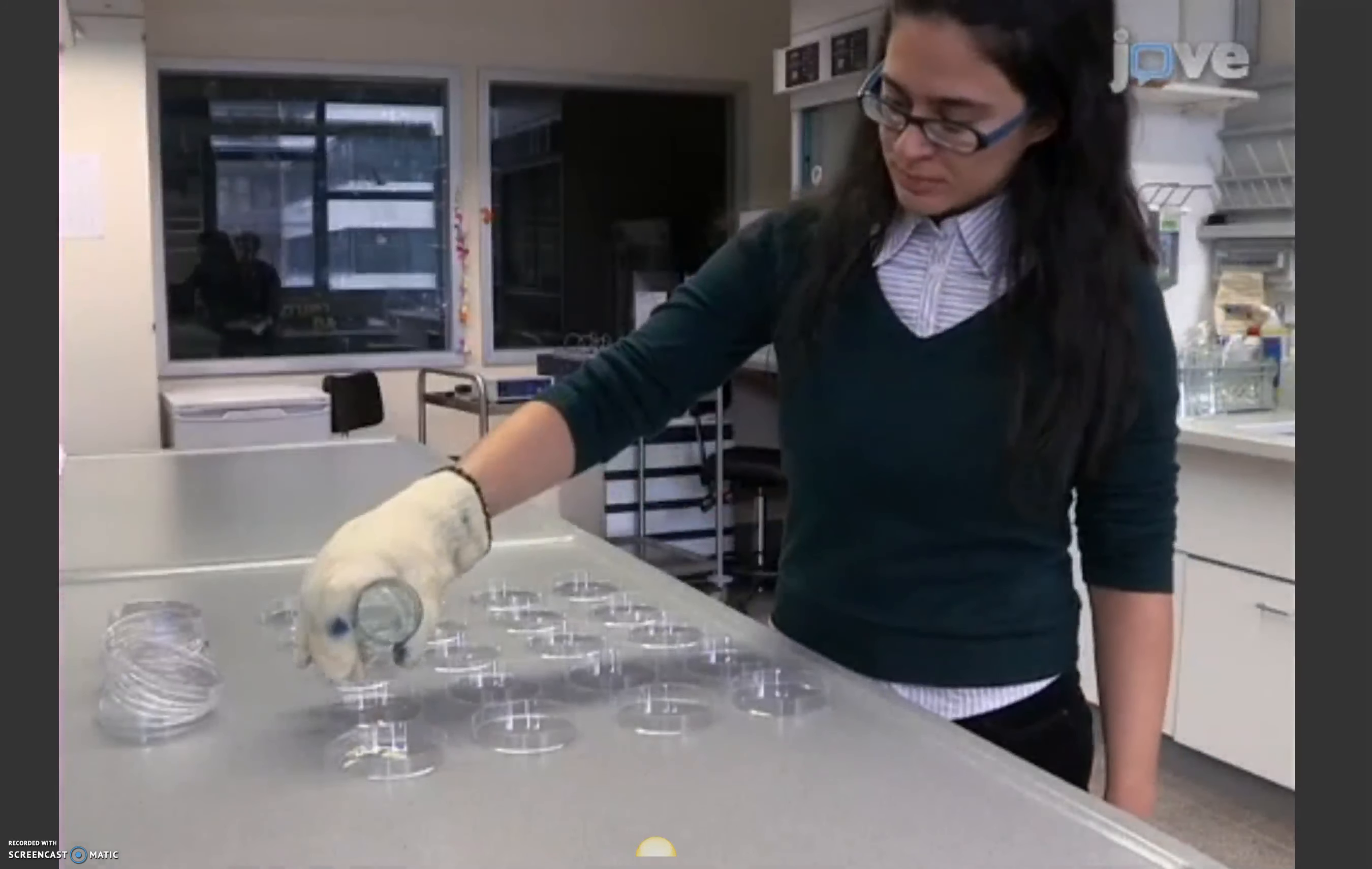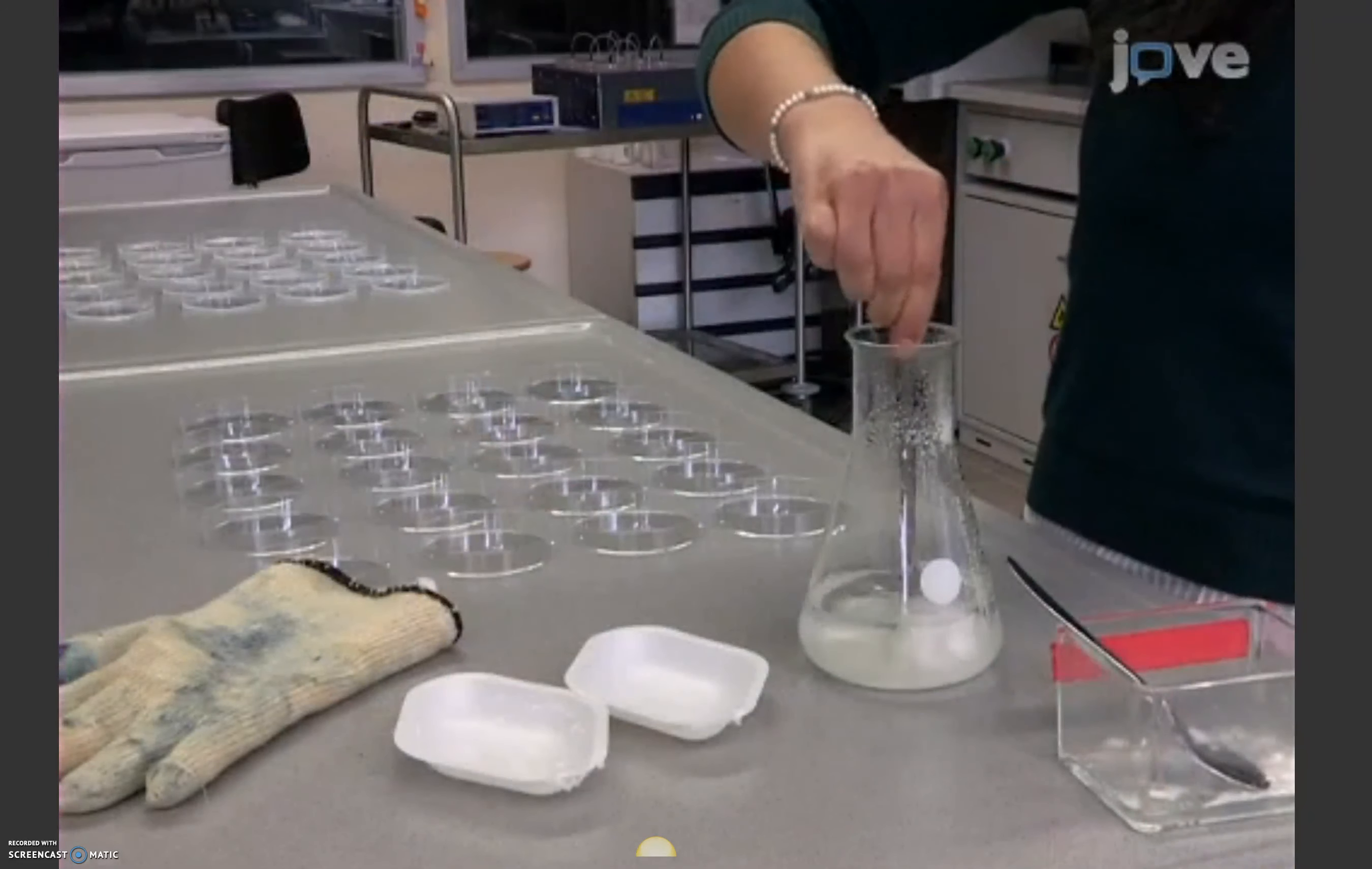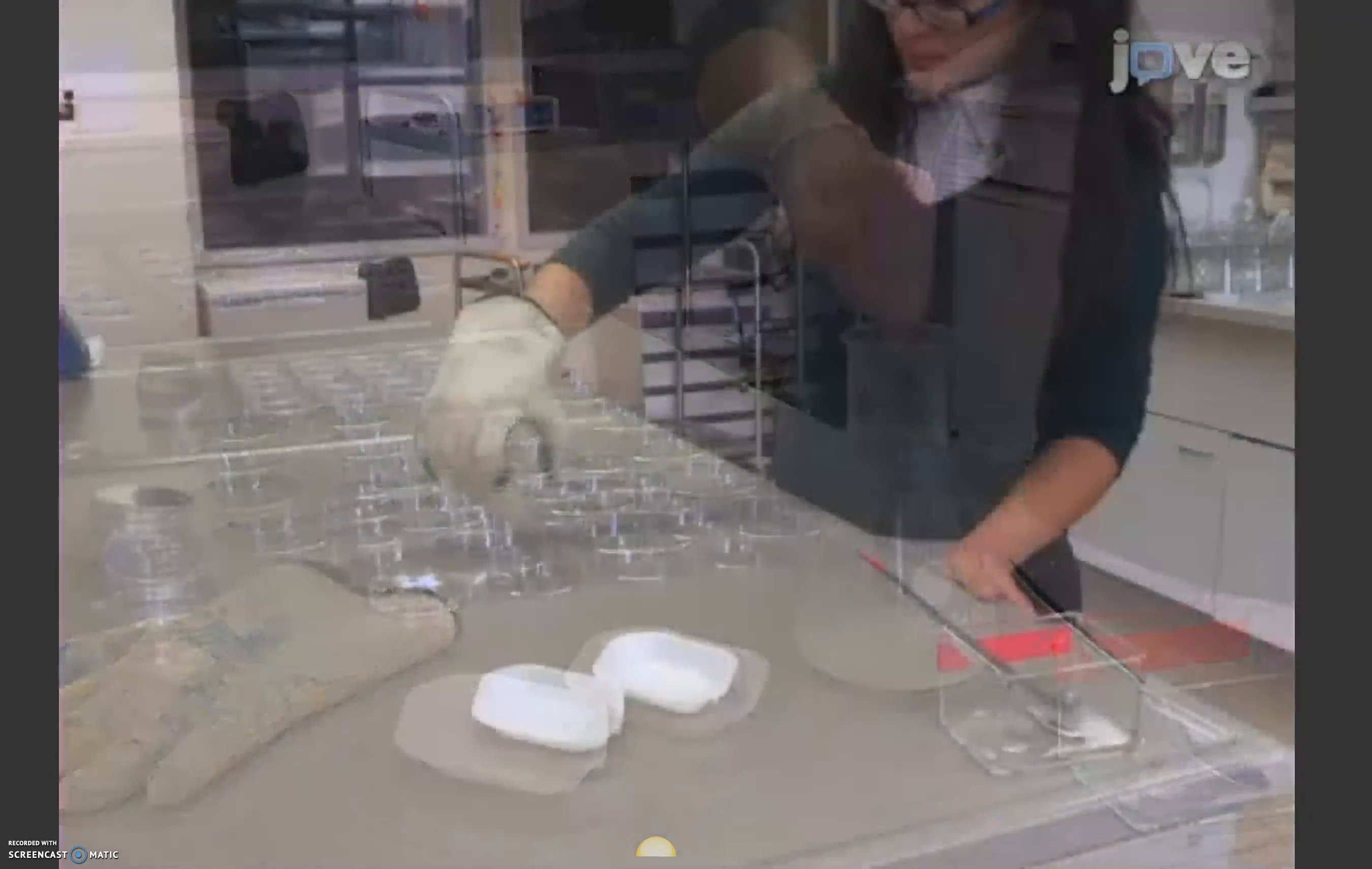First, make 2.5% agarose petri dishes without fructose. To prepare the fructose dishes, add the fructose to the dissolved agarose, and then pour it into the plate.